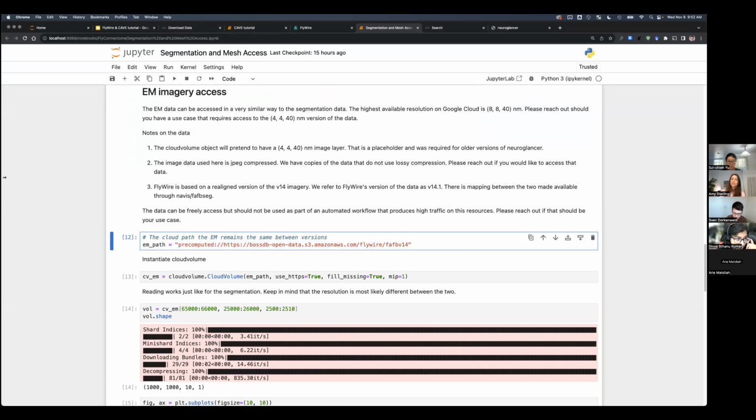Can I just ask you, we have one question that came in from Nicole Guattari about if there is an annotation dictionary or sheet that shows all the definitions. So for instance, like how point position or point root ID, et cetera, are defined.